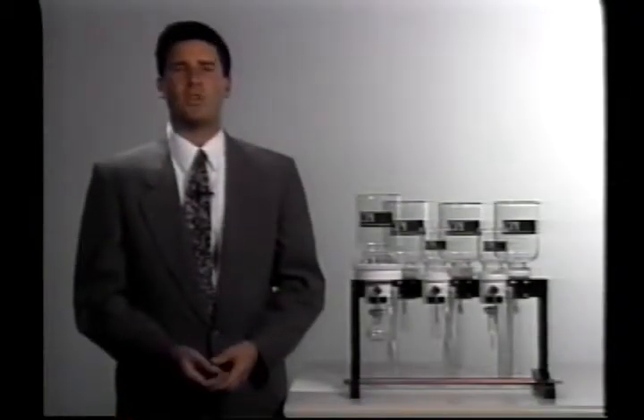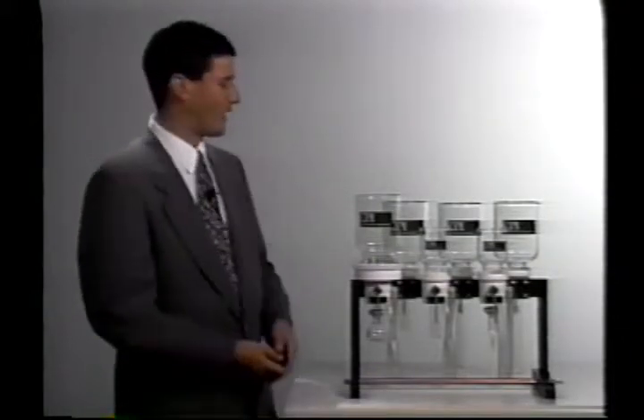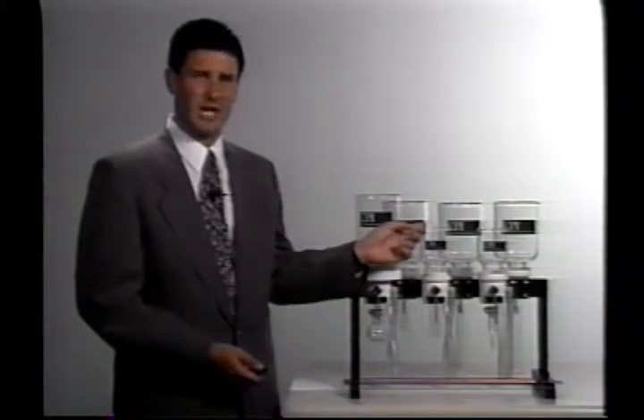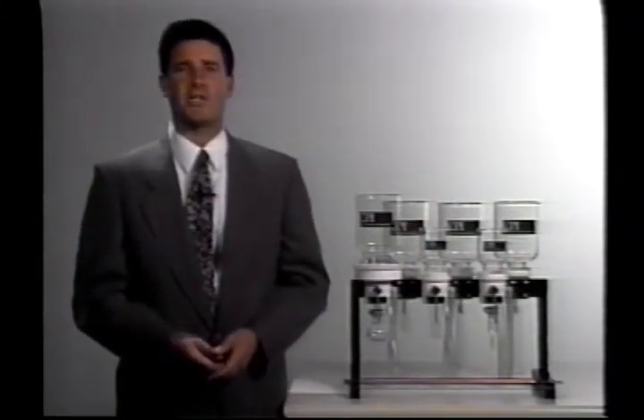CPI wanted to give you the option of selecting the size of sample reservoirs you choose per position. This manifold has some liter size sample reservoirs and some three hundred milliliter size. You can easily switch between the two and choose whichever one is most appropriate for your application.